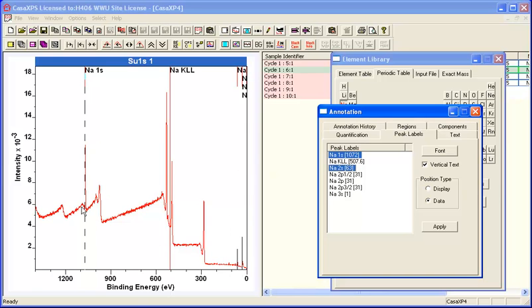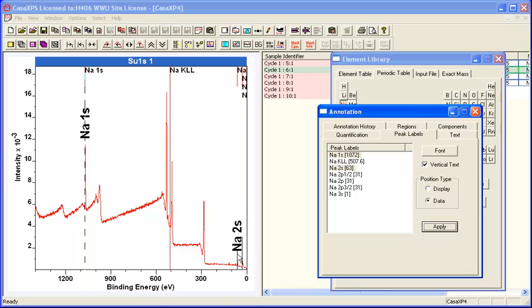If I select these and label them, that indicates which peaks are sodium 1S and 2S.